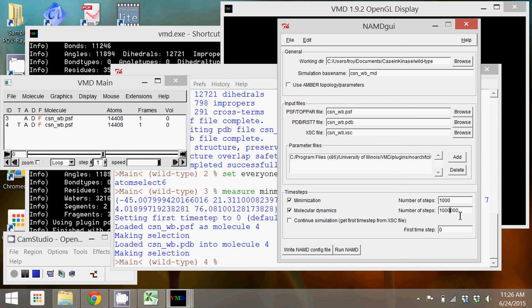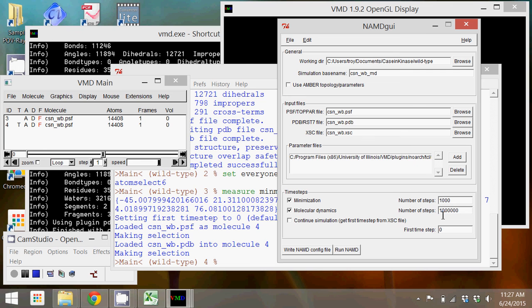This will probably take, with the minimization and the molecular dynamics, probably on the order of an hour or two to simulate, depending on the computer that you're using. I'm just using a laptop computer, and so it will probably take about an hour for this to simulate. If you want to speed things up again, you can change your time step or you can reduce the number of steps that you simulate the protein.